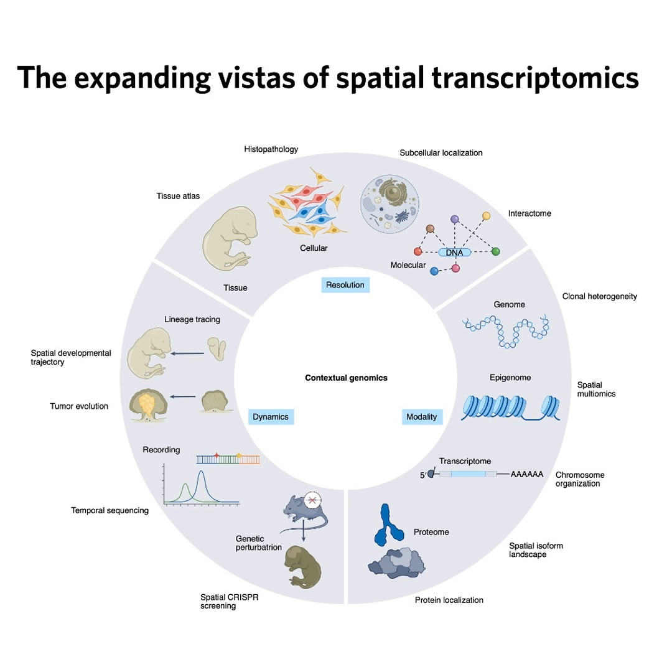How do they know which cell is which type, though? Well, that's often achieved computationally. You typically take these really rich cell type definitions that have been derived from single-cell RNA sequencing, another powerful tech, and you essentially map those known signatures onto the ST coordinates. So instead of just looking at a slide and saying, okay, that's a patch of cancer tissue, you can actually map it out. Like, here are the aggressive tumor cells clustering. Oh, look, here are the T cells that have infiltrated right next to them, and over there are the structural fibroblast cells. Precisely that level of detail.